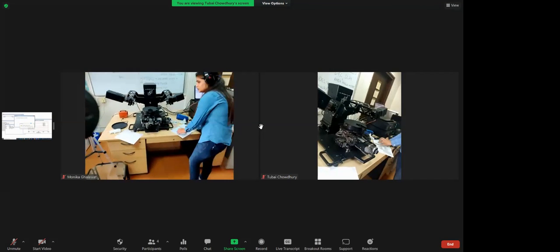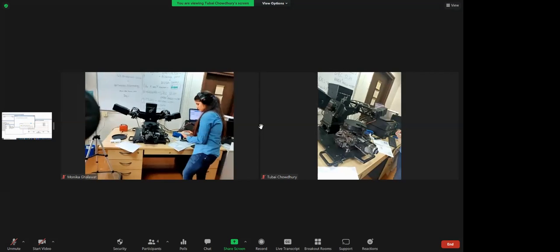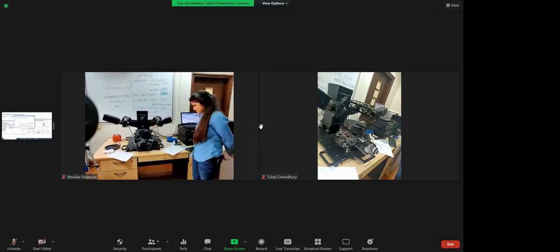Ma'am, this demonstration shows whether the substrate is optically smooth or not.